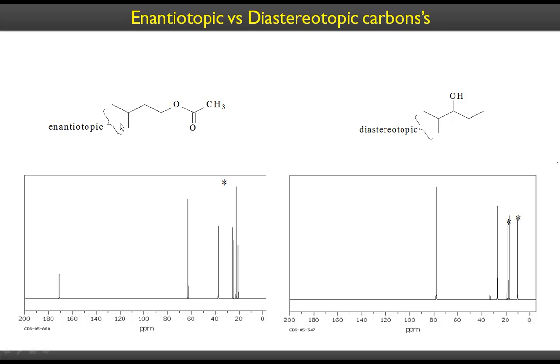If they are chemically equivalent, the Pople notation tells us that they are magnetically equivalent as well. These 2 methyls are called enantiotopic methyls. The enantiotopic methyls would have the same chemical shift. So as a result, the number of peaks that you can expect for this compound is much less, at least less by one, because there is symmetry at least in this part of the molecule.